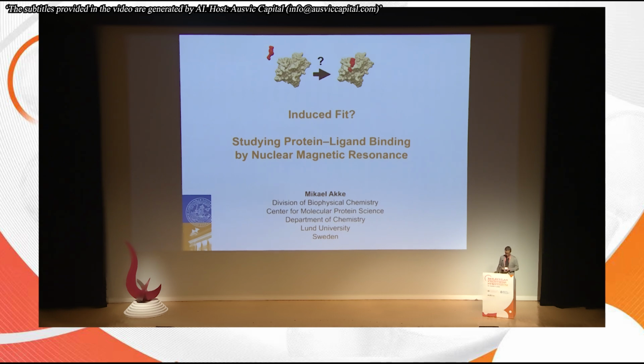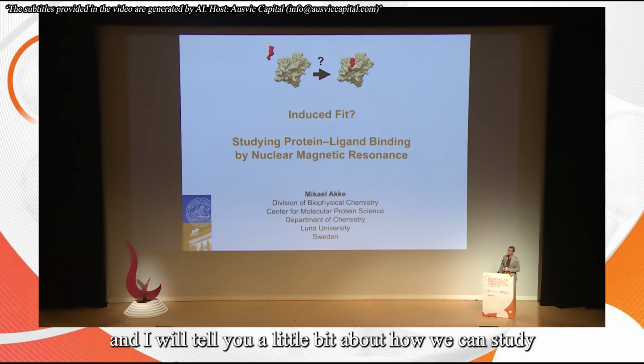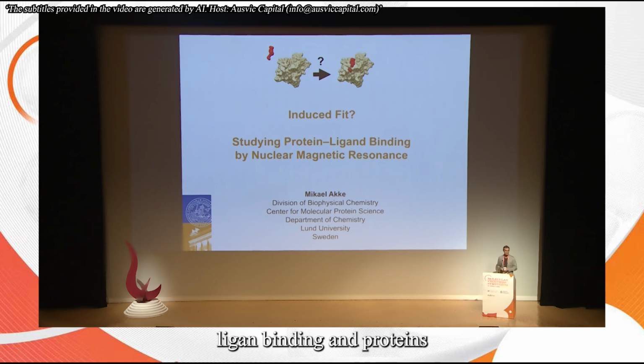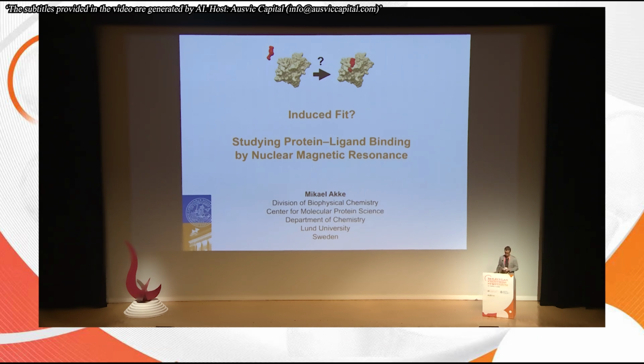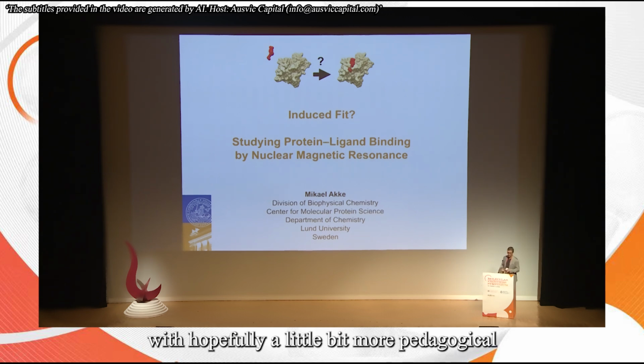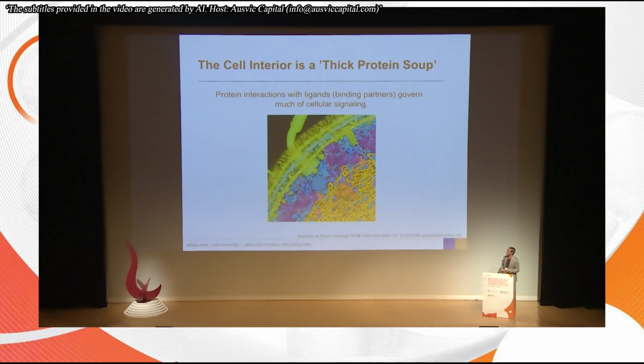The title is Induced Fit, and I will tell you a little bit about how we can study ligand binding in proteins and how we use nuclear magnetic resonance to do that. So this is a research talk with hopefully a little bit more pedagogical aspects to it.